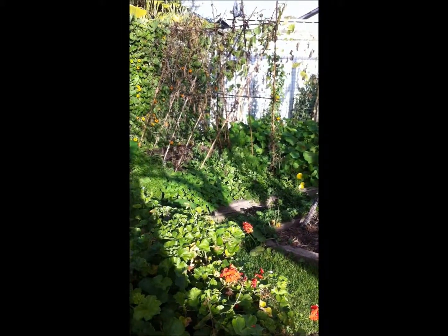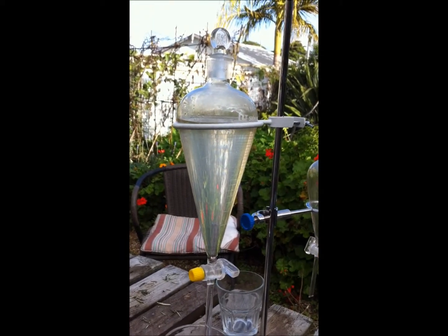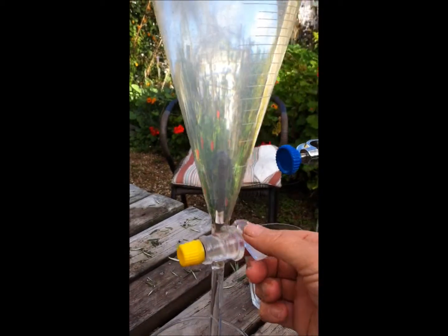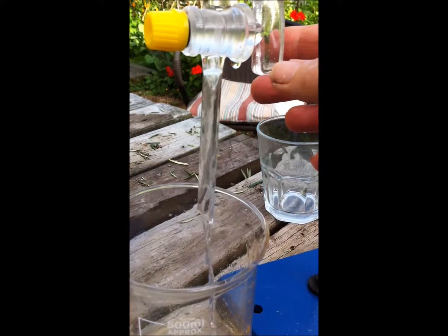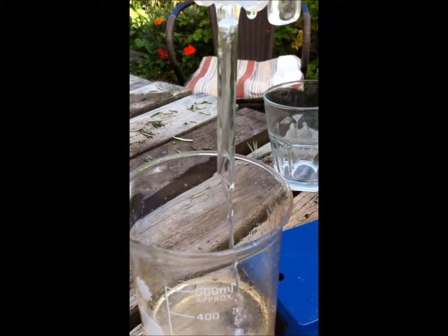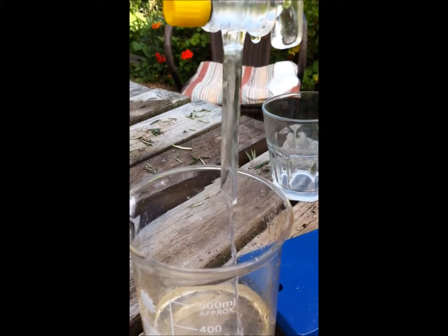I now have 500 mils of lovely aromatic fresh rosemary in my oil separator, so I'm going to turn the tap on and drain the hydrosol out. I also thank a very famous New Zealander for letting me pick this lovely rosemary on Waiheke Island.